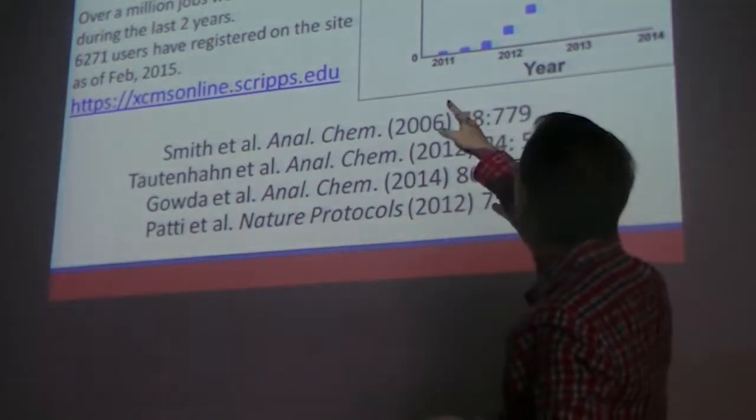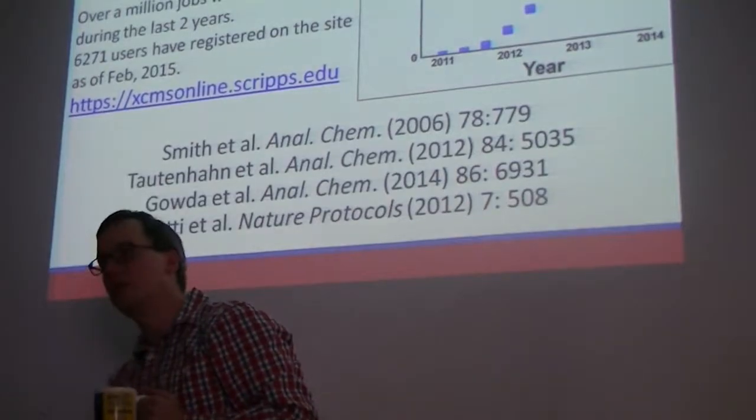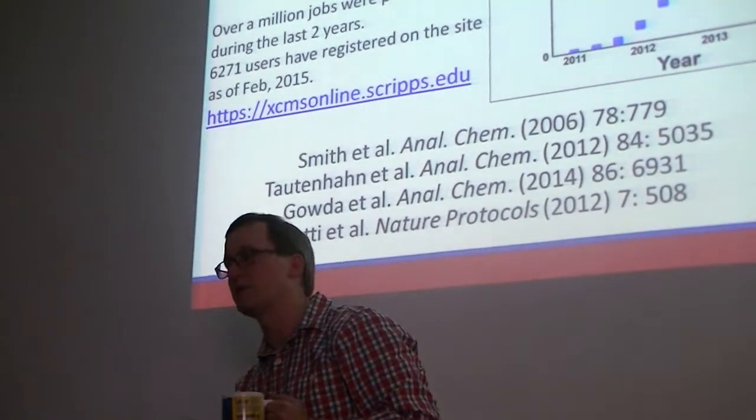Anyway, you can see that the usage of this system is just growing by leaps and bounds. Gary Siuzdak's lab has been one of the most substantial in this space of metabolomics for a long time.